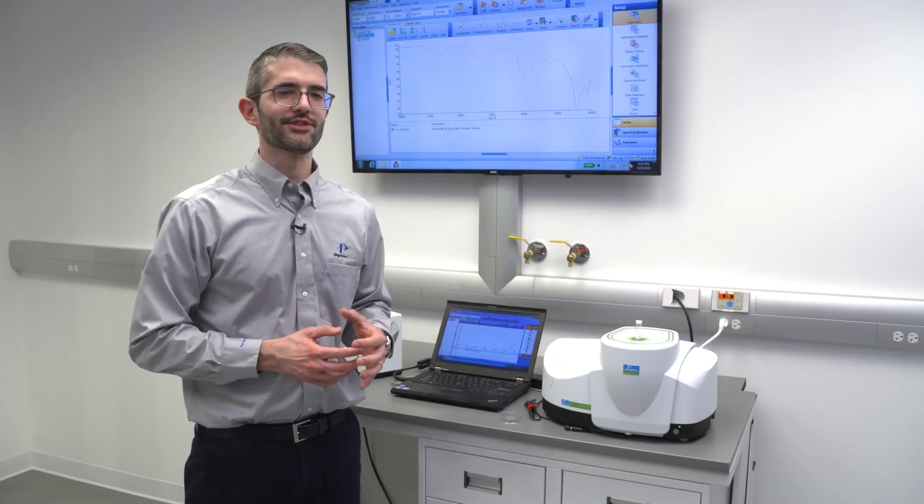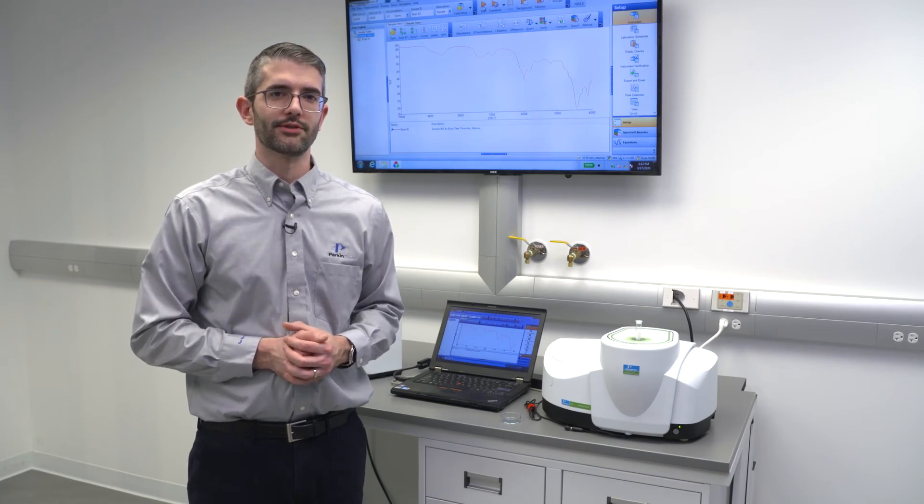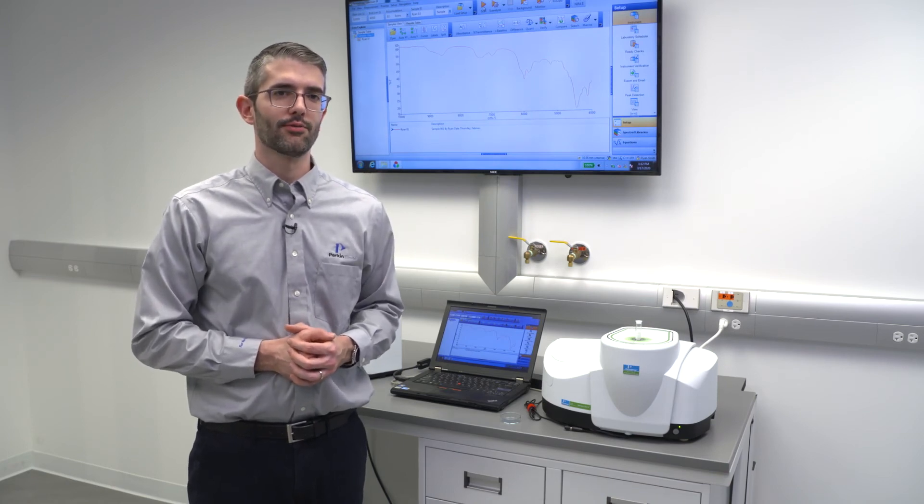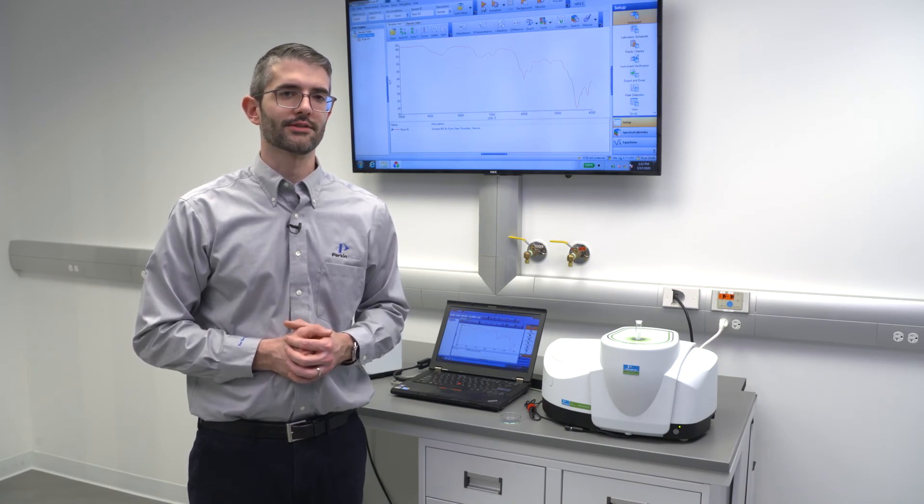A near-infrared instrument such as this is typically used for testing incoming raw materials used in a variety of products, whether they be pharmaceutical, personal care products, or food products. When testing incoming materials, typically the test sample spectrum is compared against a relatively small, targeted database of spectra which the user has collected, representing known good reference materials.